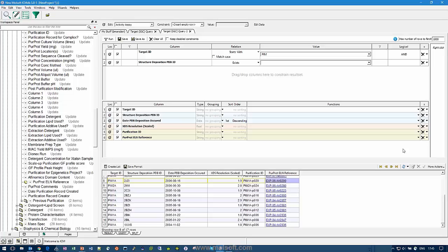If I reran that query, so if I just clicked on run again, for example, then I would see that modification in there. When it comes down to modifications that occur when you're editing data yourself, again, Scarab is very careful about that, but there are always some scenarios that you can't legislate for, but we do think carefully about that. It is a serious problem, yeah.